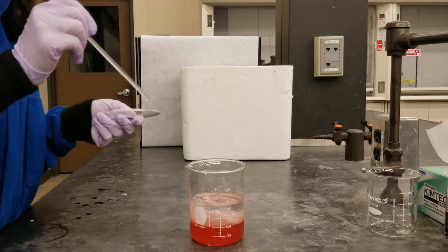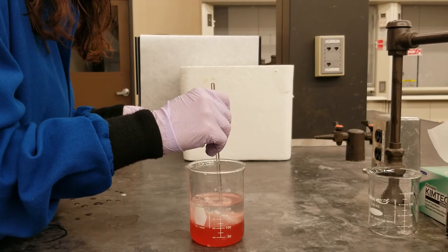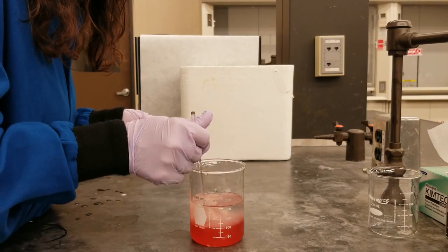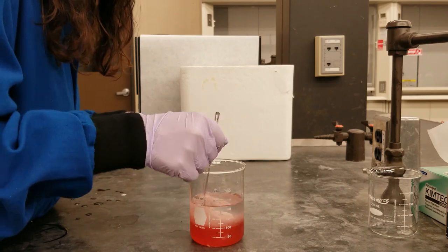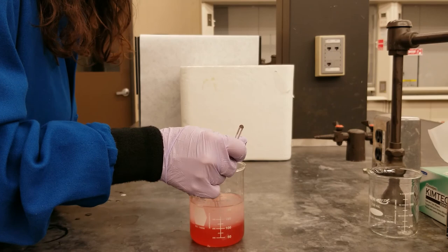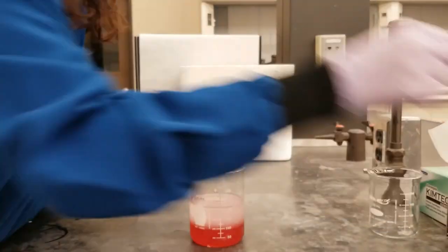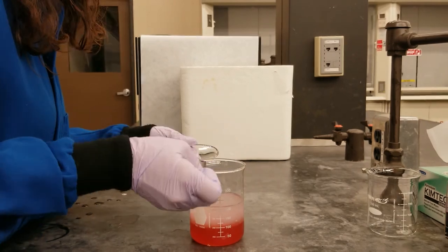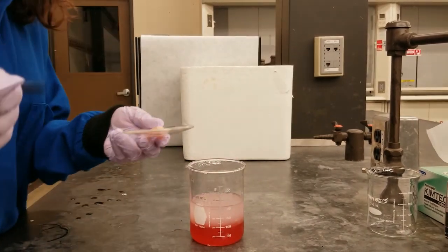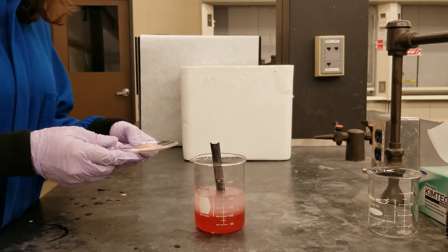We'll now collect our DNA by using our stir rod and slowly pulling the layer away. And there you are.